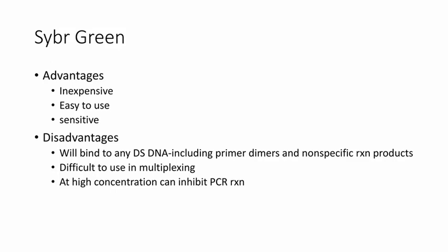But there is also some disadvantages that come with it. It's going to bind to any double-stranded DNA. So this includes something called primer dimers.